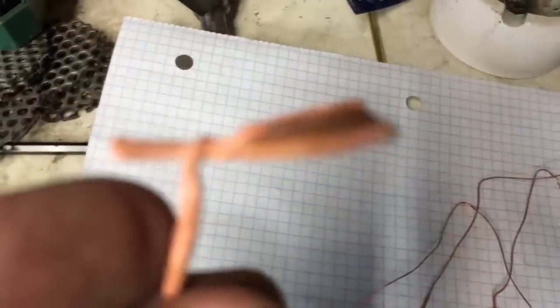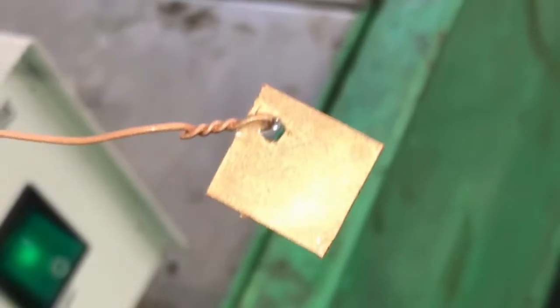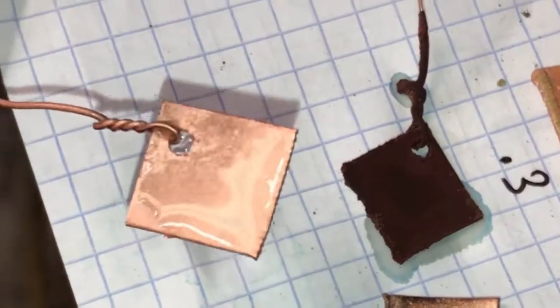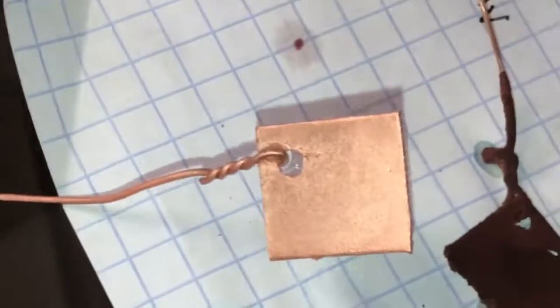Oh man. Okay, so here's with the pure copper, about a half hour in. Camera's not picking it up very well, but the dang thing's got some good shine to it. Look at that. Man, the camera's just not capturing the quality of this.